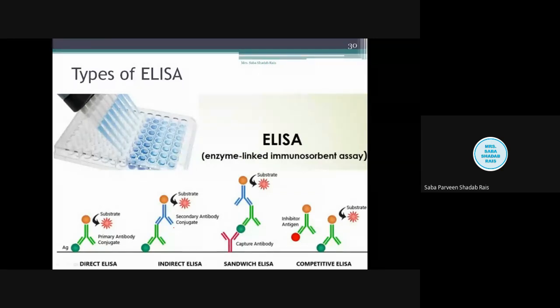So at that particular time, we prepare the secondary antibodies over the primary antibody. Now the question comes here: how and why is this secondary antibody required? Suppose anti-X antibody is going to be injected into another type or another species of animal. For example, if a human antibody is injected inside the mouse, what is going to happen, children? Yes, tell me what will happen.